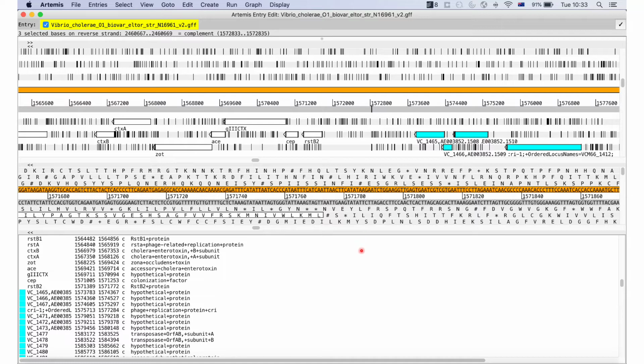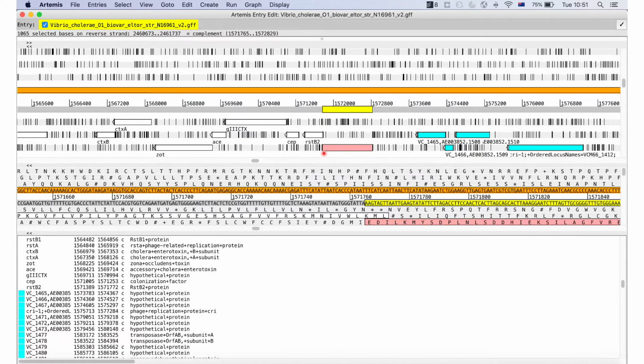So putting some of this together now, I found an empty open reading frame. That's this one just here. And I didn't make this, by the way. I didn't just do it for the example, but it wasn't annotated properly. And it's conveniently located near some genes that have been colored white by the people that submitted this genome. And this also happens to be the CTX phage. So I can see that there's probably an empty open reading frame here that probably encodes for a real gene.